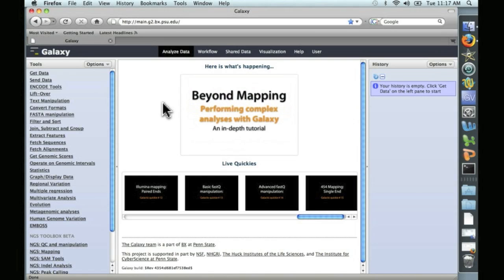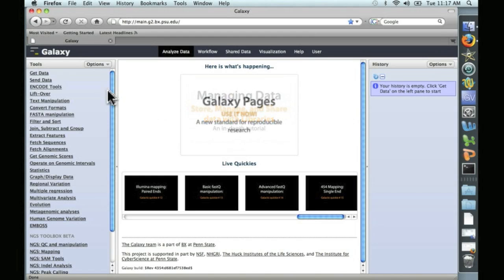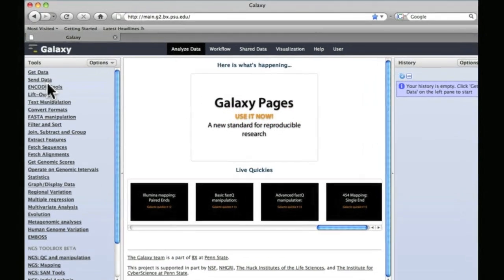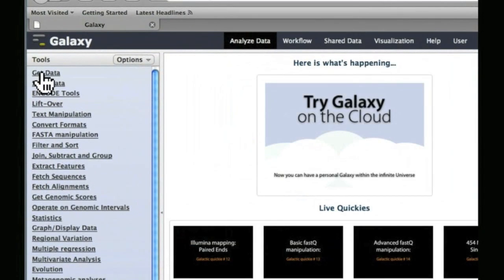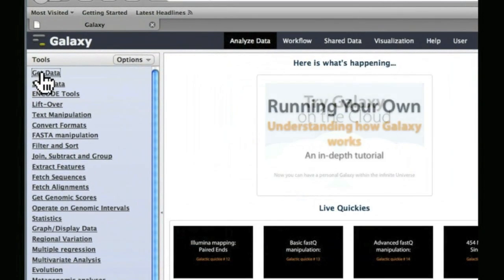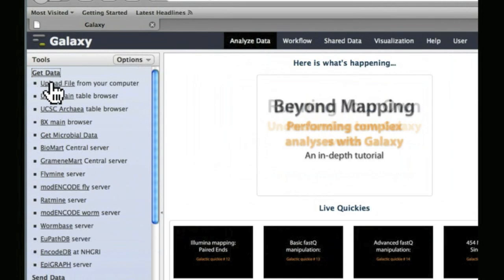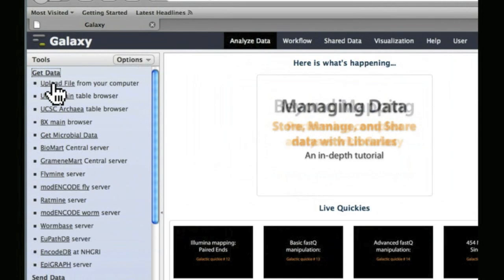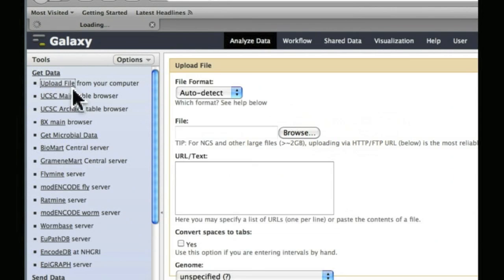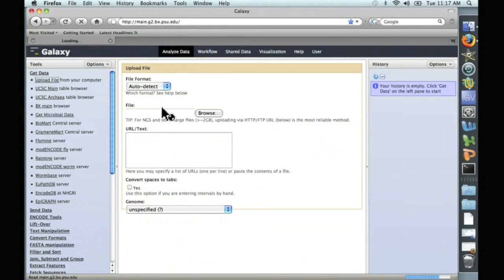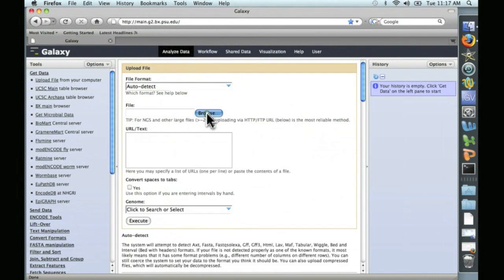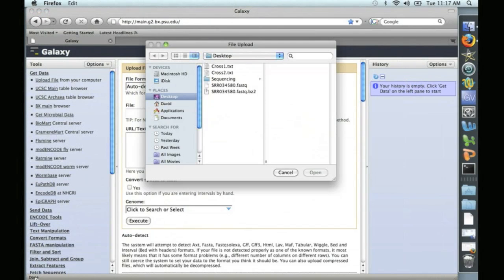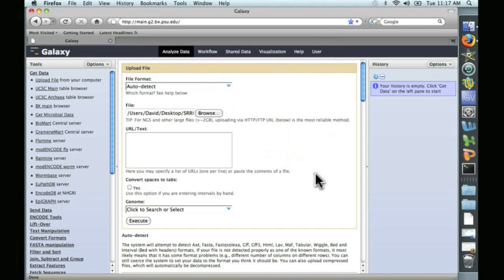So we're going to first start with Get Data over here. Click on Get Data. And as before, we're going to upload a file from our computer. And let's give it the file. Make sure to upload the FASTQ file, not the ZIP file. It's 735 MB. This is going to take a while to upload.